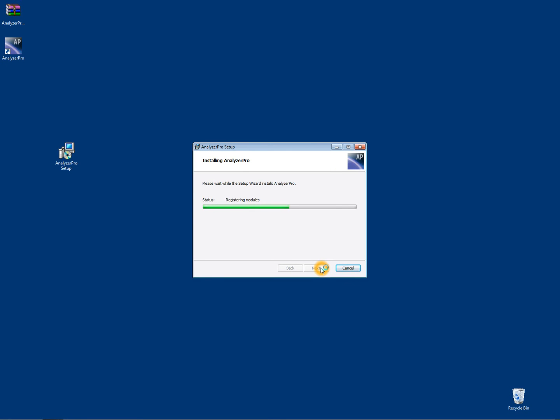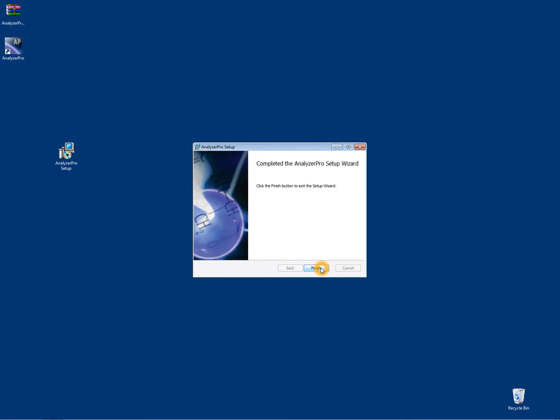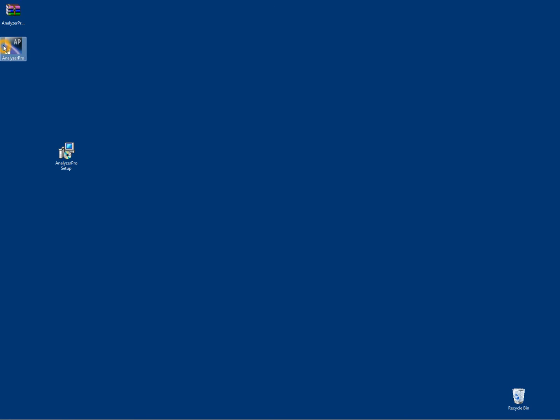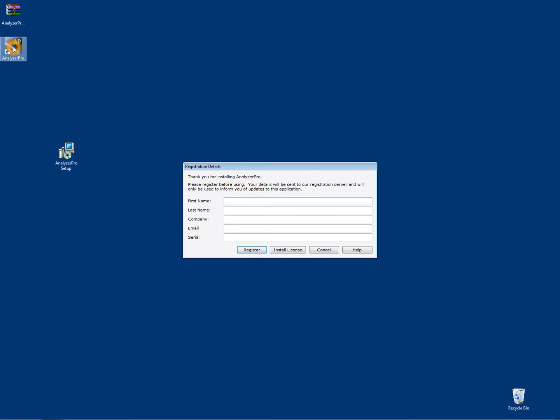Once installed, you will have an Analyzer Pro desktop icon. Double click the icon and enter your details. Please enter your correct email address and the serial number that was provided to you in the download request email.